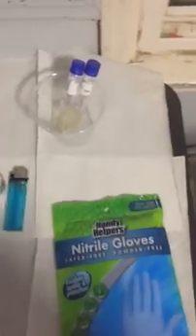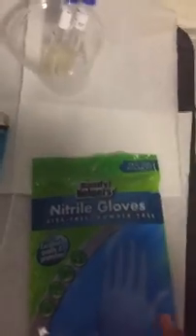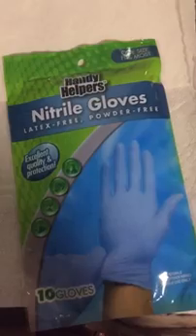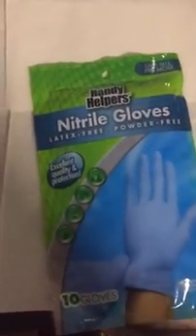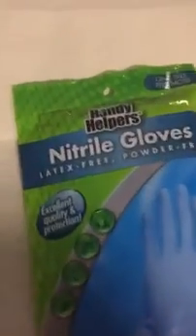And then the experiment asked us to use apron and facial mask. I don't usually use the apron and facial mask because I know when I read the instructions there's no splashing involved, so I will not use this. But of course I always use the gloves, which is a personal protective equipment that is necessary, so you can protect yourself.